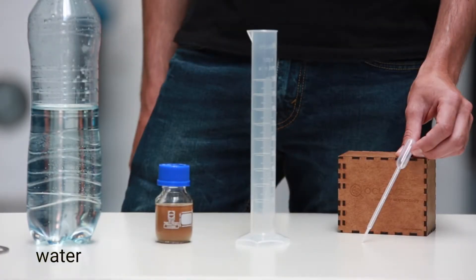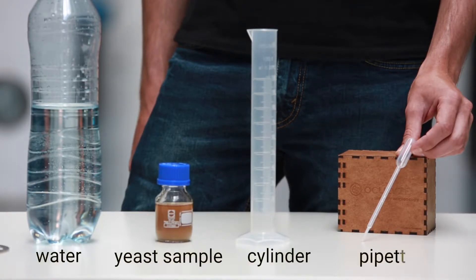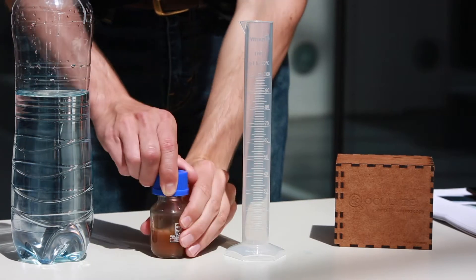Let's begin with dilution. This is what you'll need. Make sure your yeast is well mixed.